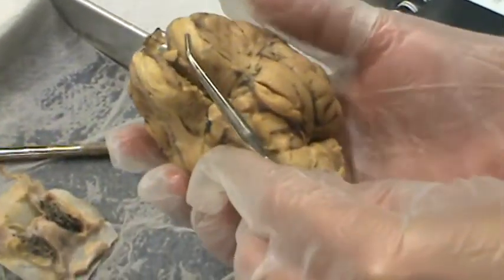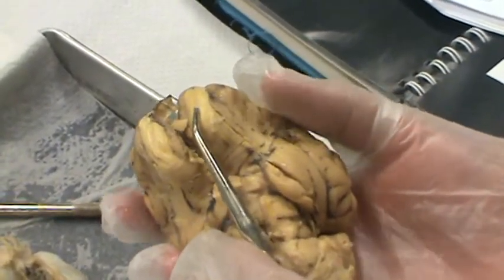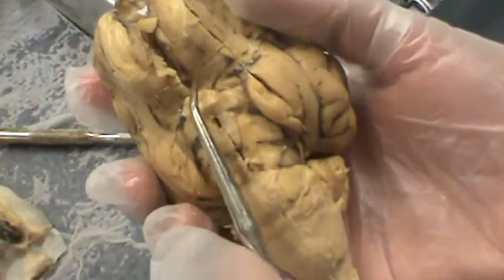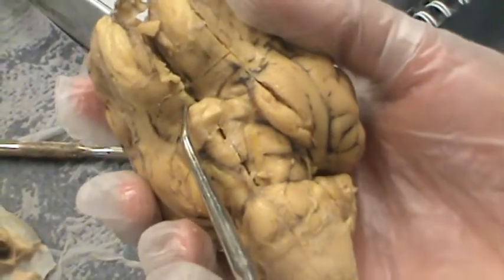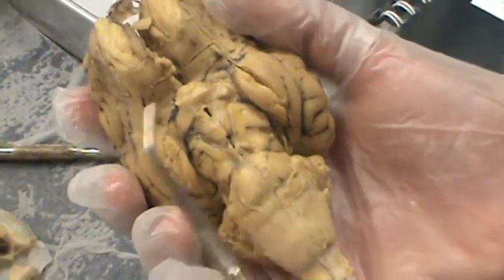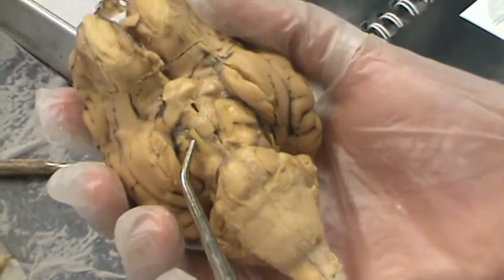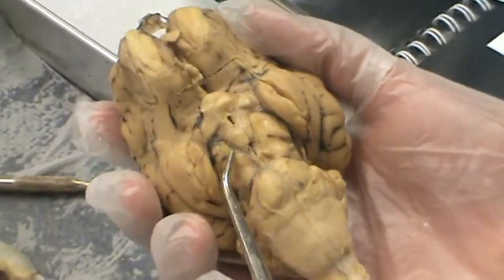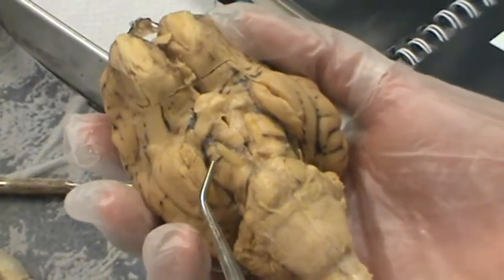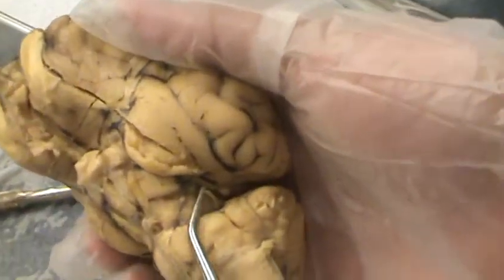Now the cranial nerves. The olfactory nerves. The optic nerves are the X. The oculomotor is the middle of the midbrain. Oculomotor. And then the trochlear is between the cerebrum and the cerebellum, which is right here, this little flap.